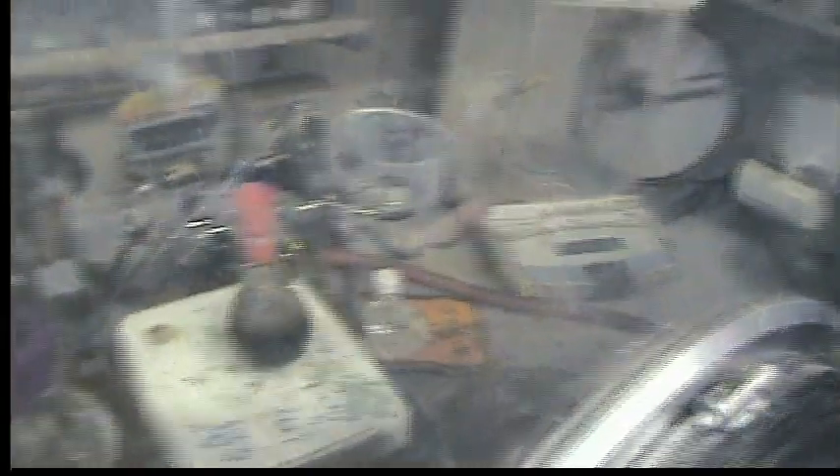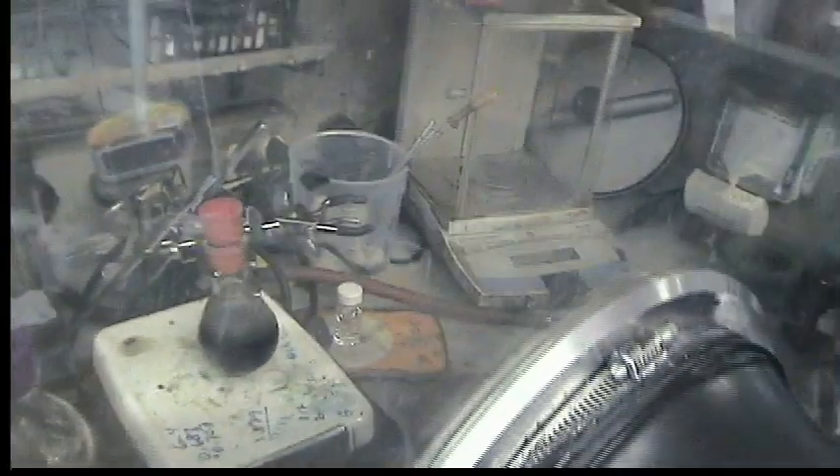We're going to let this warm up to room temperature and stir for about one hour, maybe slightly less, and then we'll come back and filter.